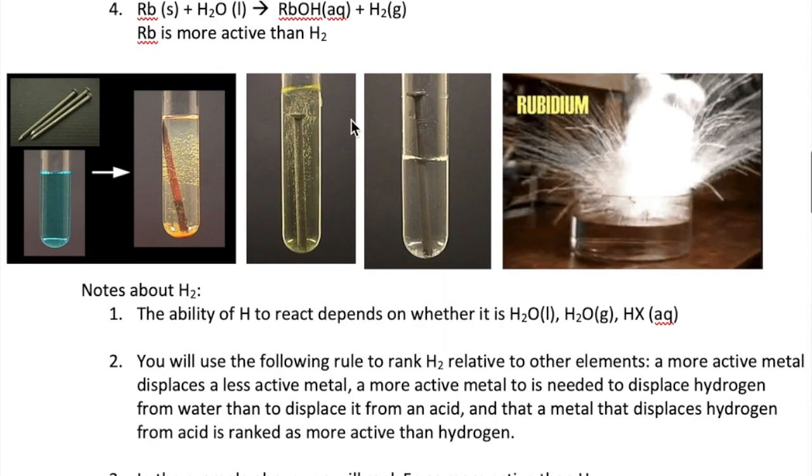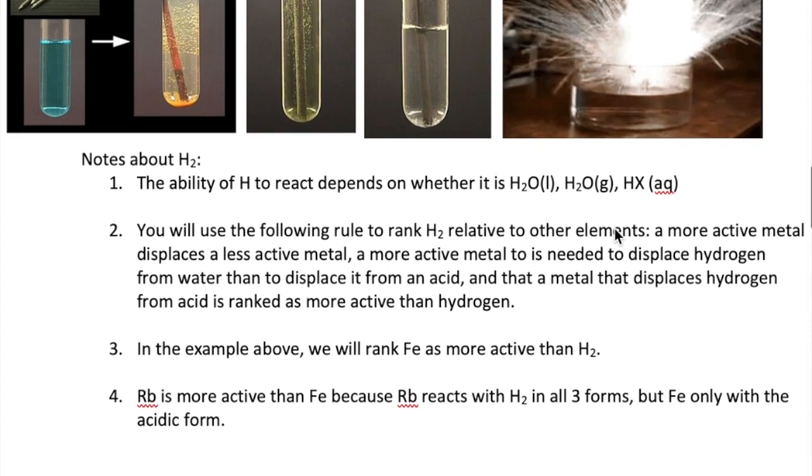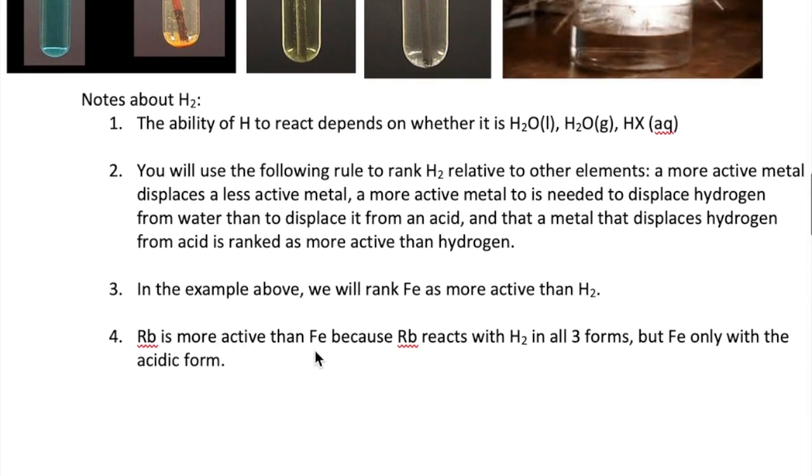The last result I want to discuss with you is when we mix rubidium with water. Here we see a very explosive reaction which produces hydrogen gas. There's so much hydrogen gas and heat produced that the heat causes the hydrogen to react with oxygen from the air surrounding the experiment, resulting in the explosion you observe. Because rubidium reacts with H2 in the liquid water form, it will automatically also react with H2 in the steam form and H2 in the acidic form, since those are more reactive forms of H2. As a result, we can immediately say that rubidium is more active than H2. One last conclusion is that rubidium must also be more active than iron, because rubidium can react with all three forms of H2, whereas iron can only react with the acidic form.